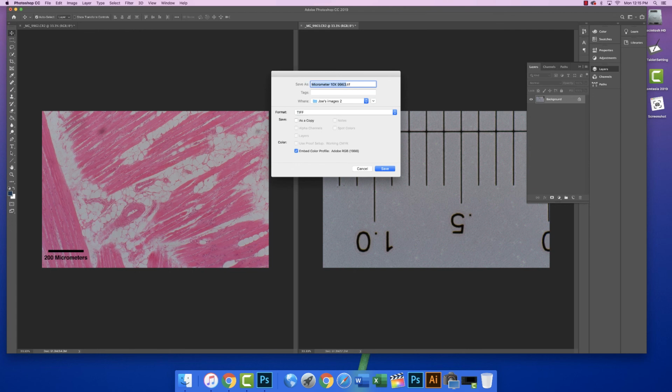Of course, we haven't tried to enhance this image in any way, which I'll get to later on in the semester. Of course, it's a scientific image, so we need to maintain the integrity of the image and not in any way make this image misleading.